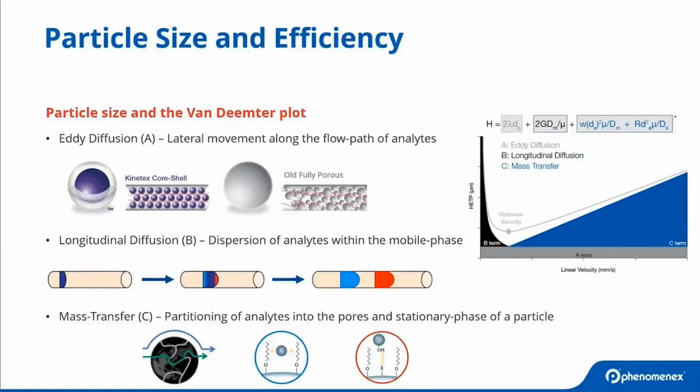But if you let them just stand around, pretty soon they're going to run amok. So with respect to the means by which an analyte band is ushered through the column, a faster flow rate keeps that analyte band nice and compact and prevents our molecules from diffusing about on their own accord.